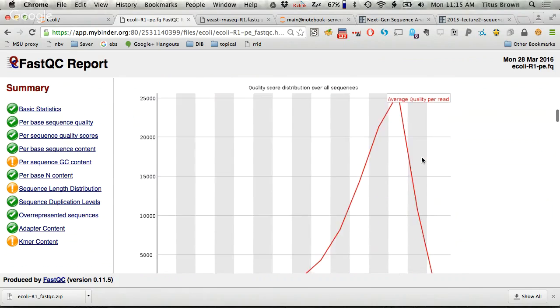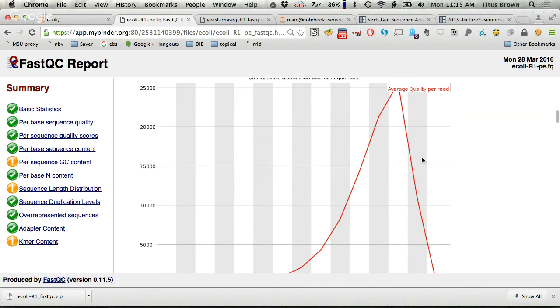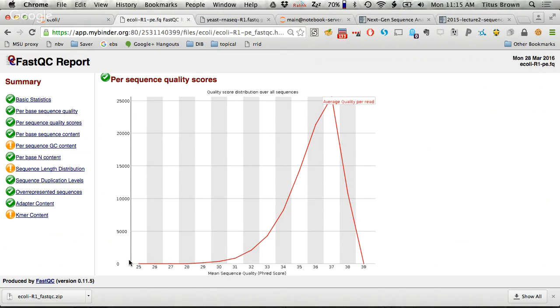Let's go look at the distribution here. So why is it that there are no sequences that approach a quality score of 20? This is the fun thing about Illumina. This is more true of the older Illumina data, but you might still see it in your newer data: a lot of Illumina sequence tends to be pretty good, and the Illumina sequence that's not good is really bad.